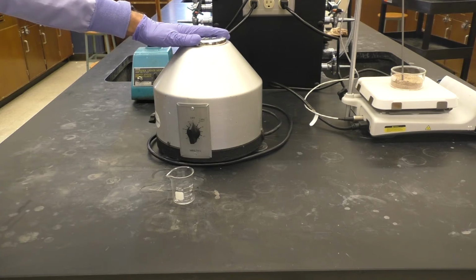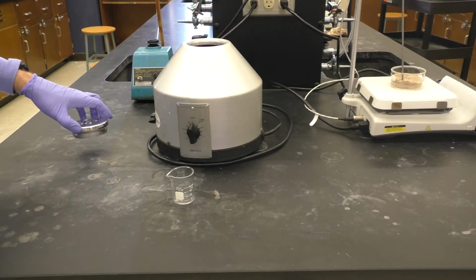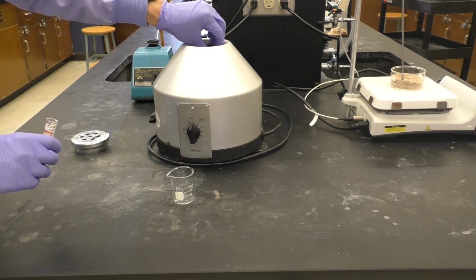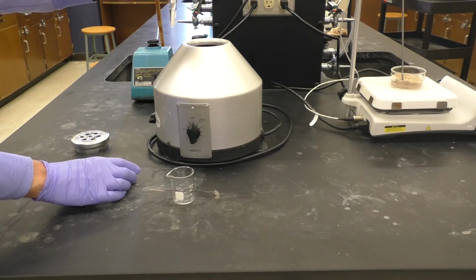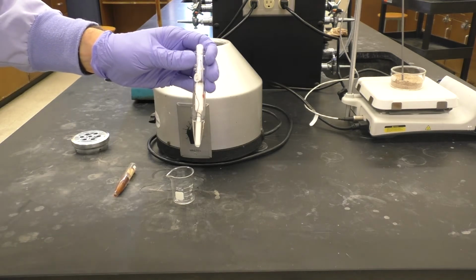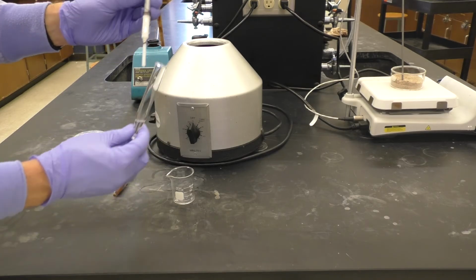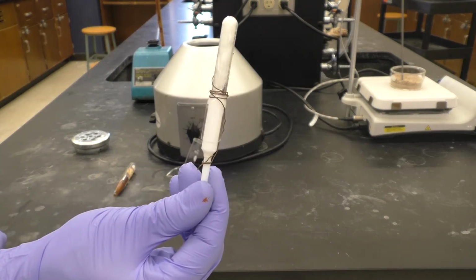See that my centrifuge is not perfectly well balanced. That tube I put in to balance it must not be exactly the same weight. And so when I turn the rotation up on the centrifuge, it causes it to vibrate and move, which is unsafe. So we need to be careful about that. If we need to do more filterings this way, we can get a better balanced tube. But here, you'll see I have now removed essentially all of the solvent and left only crystalline material in the tube.